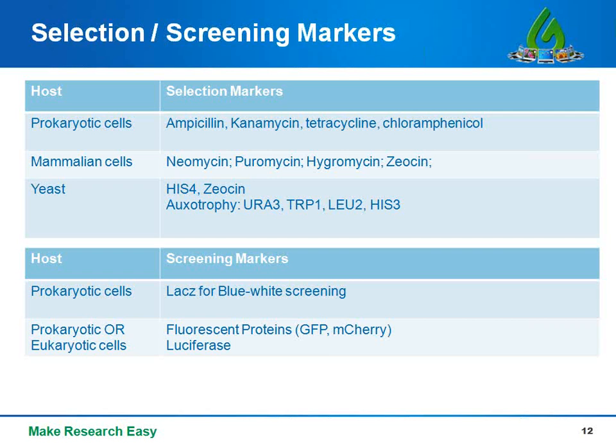But you'll notice there are lots of different antibiotics that are commonly used. And in particular, in mammalian cells, when you want to select for the presence of two separate plasmids, you'll want to make sure that your plasmids contain different antibiotic resistance genes that are complementary, so that you can then apply both antibiotics to select for the presence of both plasmids.